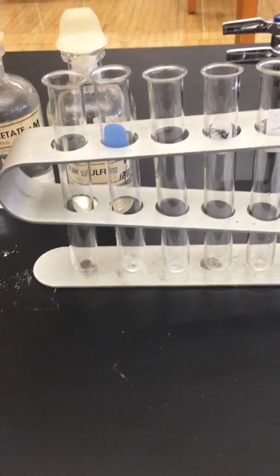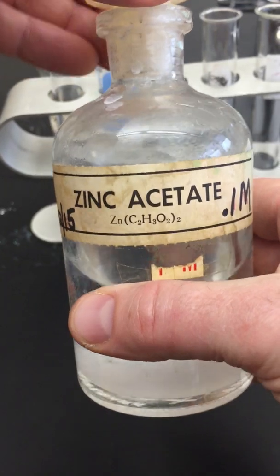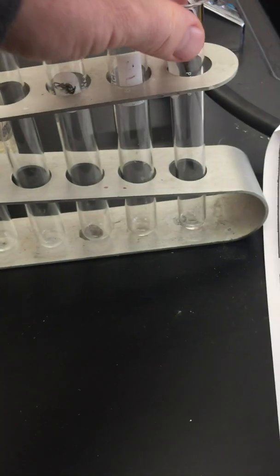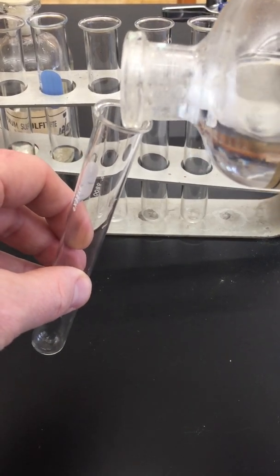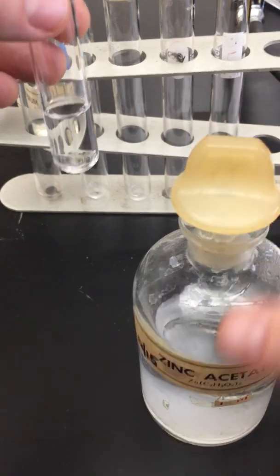Okay, so the last part of this lab is a double replacement. In this case, I'm going to take zinc acetate, which is here, going to pour it into one of the test tubes. Somebody left some water in here. Plenty.